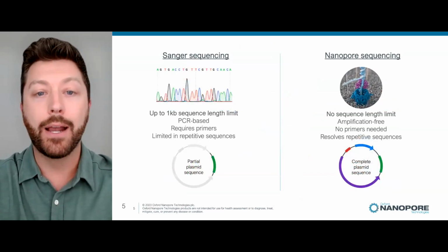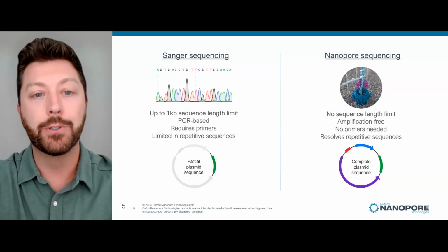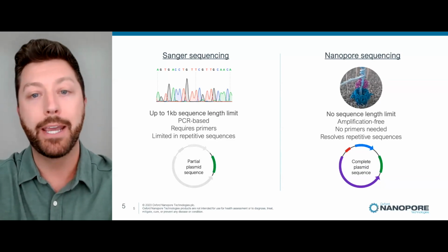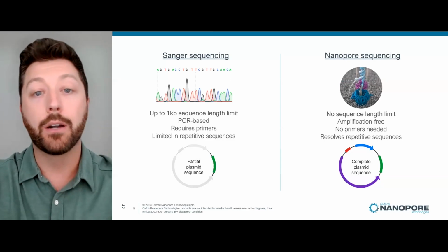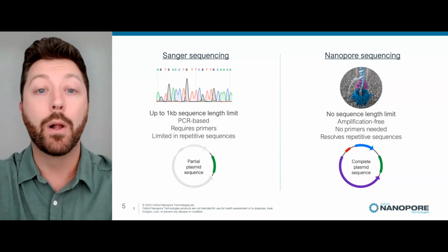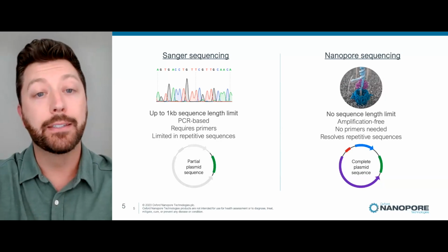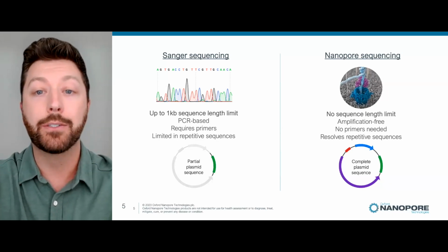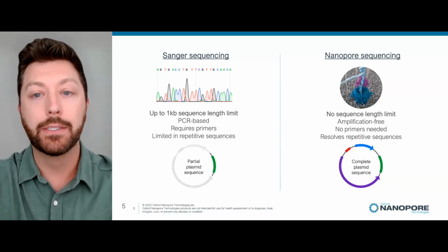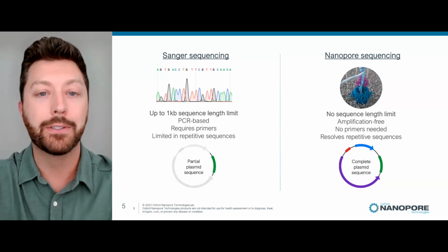But we know that errors can arise during plasmid assembly due to a variety of factors, such as imperfections introduced during enzymatic processes, as well as mechanisms involved in bacterial repair and replication. Because plasmid constructs are fundamentally important for downstream experiments and applications, scientists often employ various quality control measures to ensure the accuracy and integrity of their plasmids. For instance, Sanger sequencing has been widely used as a method to confirm accuracy of the DNA sequence. By comparing the generated sequence with the expected sequence, scientists can verify the correct assembly of a plasmid and identify any potential errors or mutations.